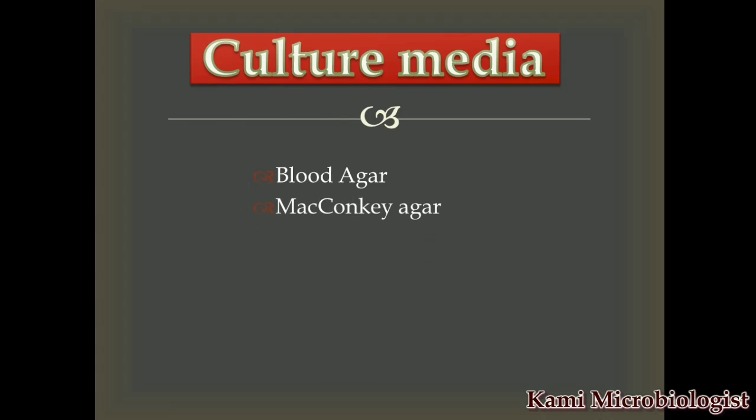Next we have MacConkey agar, which will show us lactose and non-lactose fermenting characterization, and through this medium we can grow all the bacteria except gram positive ones. We can grow E. coli, Enterococcus, Klebsiella, Pseudomonas and Proteus. Just Staph aureus will not grow on this medium. We can also say that E. coli and Klebsiella are lactose fermenters, Enterococcus is also a lactose fermenter, while Proteus and Pseudomonas are non-lactose fermenters. So in this case we will use MacConkey agar.